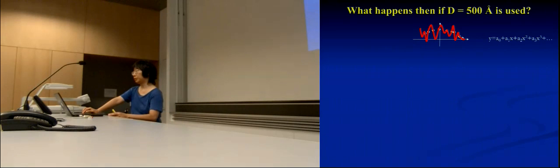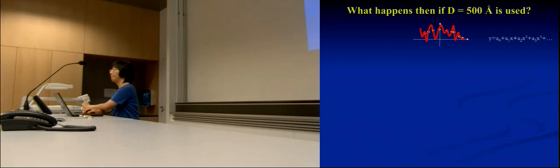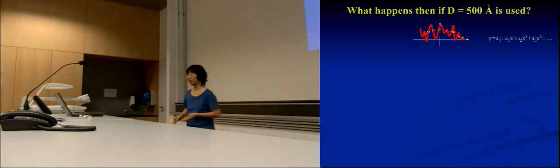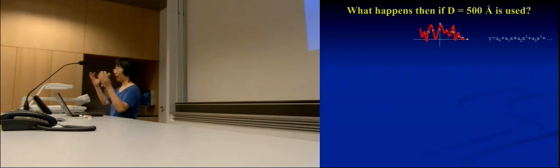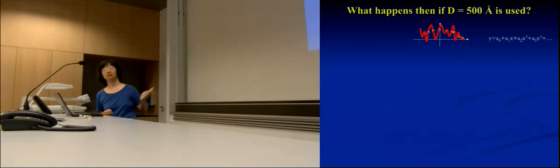Now, of course, people really overestimate what happens. So here is what happens when you overestimate. With a polynomial function, you know that I can keep on adding terms. It will still fit at where my data points are. But eventually you get something like this, right? That's wiggling everywhere. It still fits at everywhere you have a data point, but it becomes very meaningless.